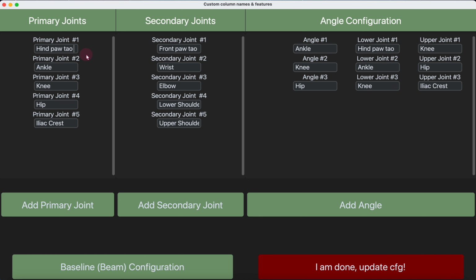These are also later translated to the group toolbox, and you're then able to select, for example, knee acceleration as a feature for your group analysis in its statistical or PCA approaches or tests.